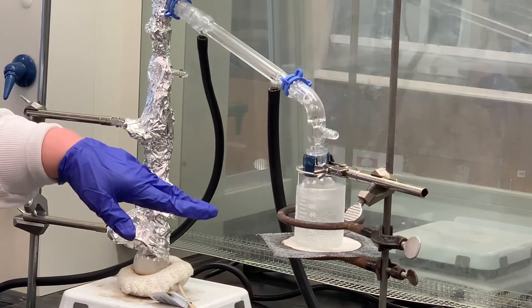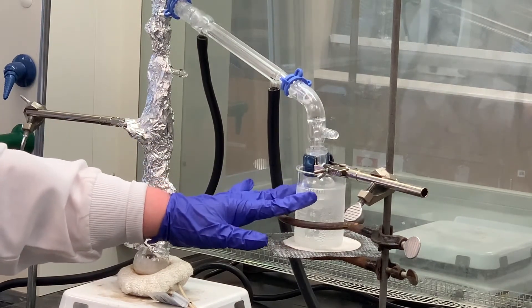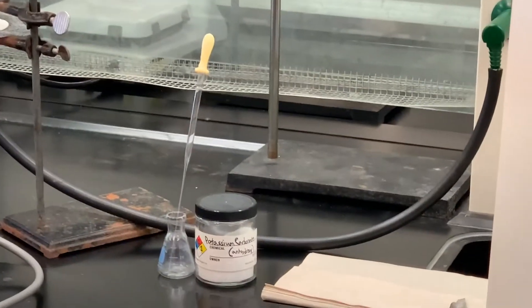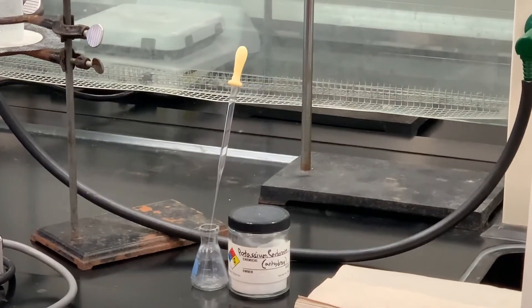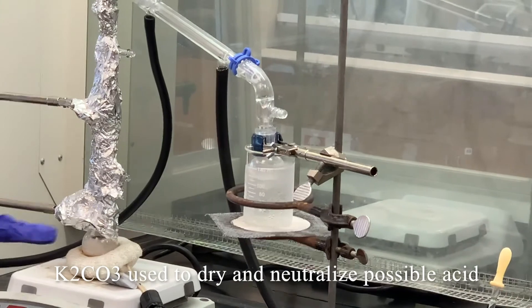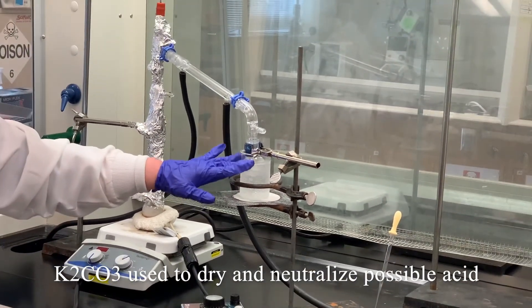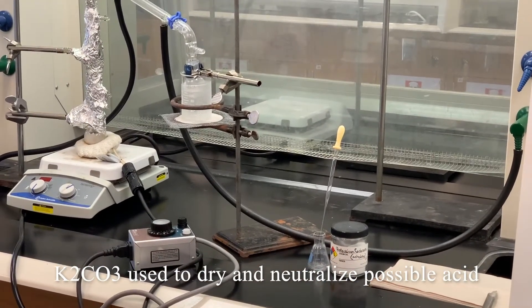Once this cools, I'll disconnect this and transfer the material inside this receiving flask to an Erlenmeyer flask. We'll add some potassium carbonate to that — this potassium carbonate is anhydrous and it's going to serve two purposes. One, if any water came over with our cyclohexene, it will help pick it up. The other thing is, if there are any trace amounts of acid, the potassium carbonate will help neutralize that as well.